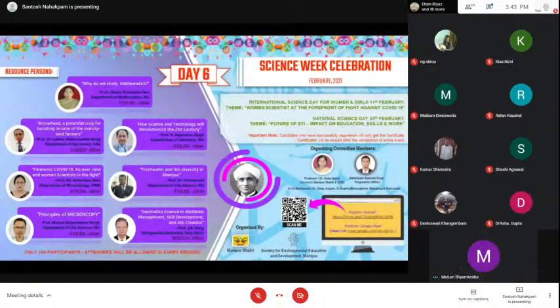In today's lecture, I'm not going to cover the new developments or research findings, but the very basics of microscopy, especially the light microscope.